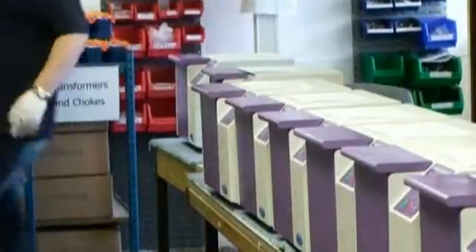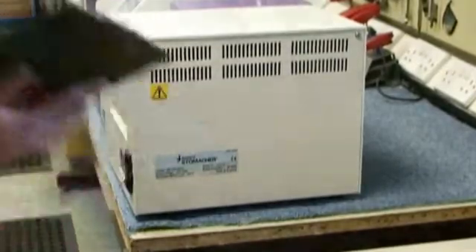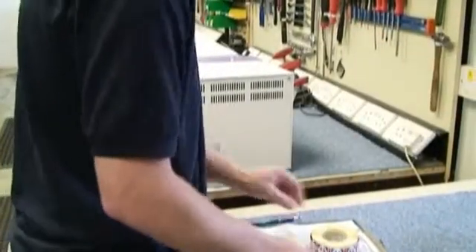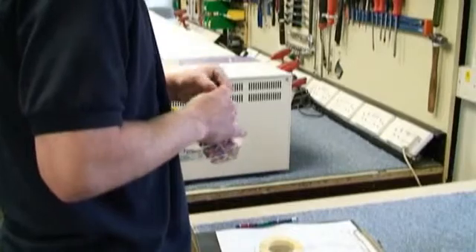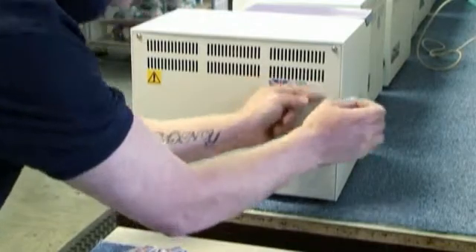All Stomachers are proudly built in the UK and manufactured to ISO 9001 standards. Seward's 15-point quality control checks guarantee reliability, consistency and traceability, allowing us to offer a comprehensive 3-year warranty on Stomacher machines.